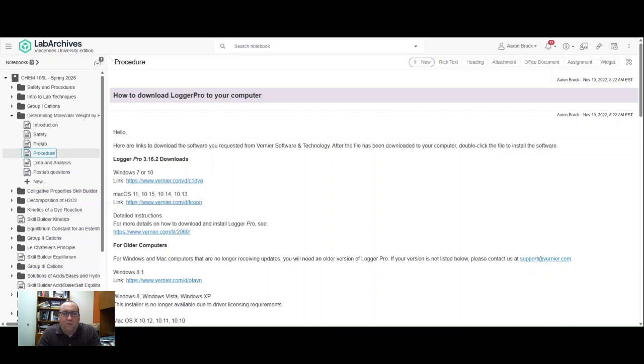Hello again, and welcome to another pre-lab video for Chem 106 Lab. The lab that we are talking about here is the first non-qualitative lab of the semester. That is the colligative properties lab, or better known as the determining weight by freezing point depression lab.